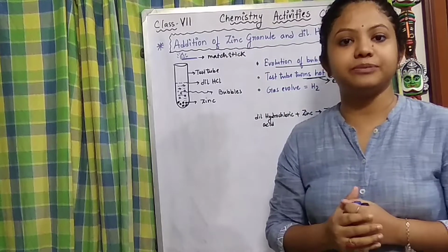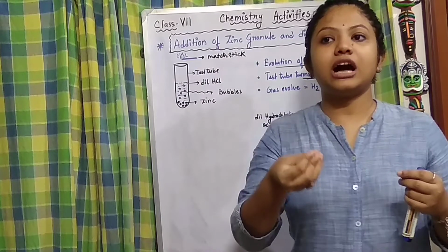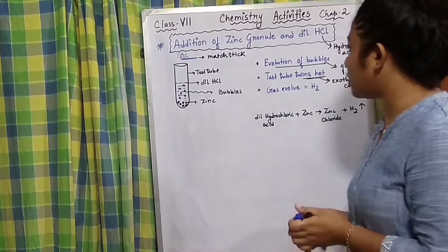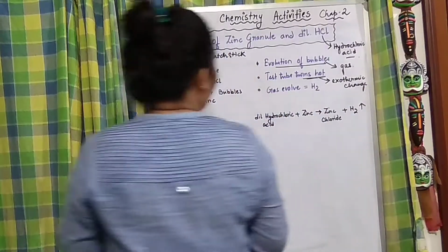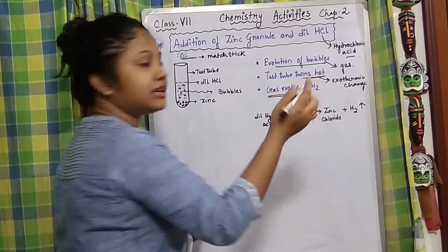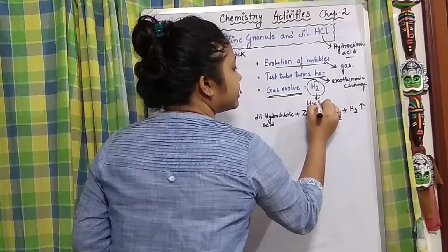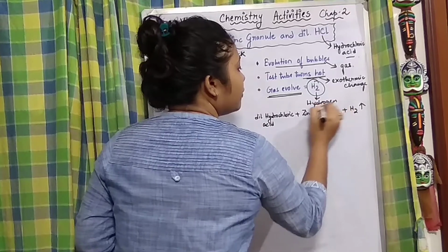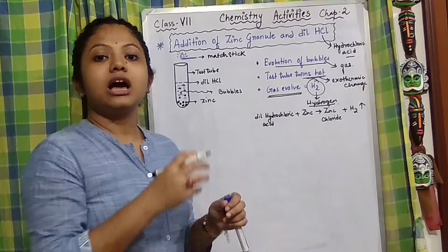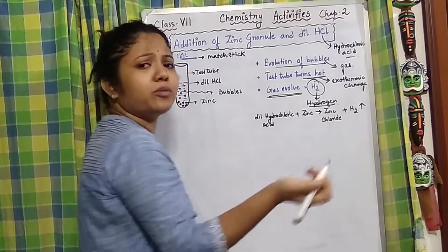And what will we see? We will see that the match creates a pop sound. Okay, now why this pop sound? This is because of the evolution of gas, and that gas is hydrogen. H2 stands for hydrogen. So we understand that in this experiment, hydrogen gas is evolving. Now why this pop sound?